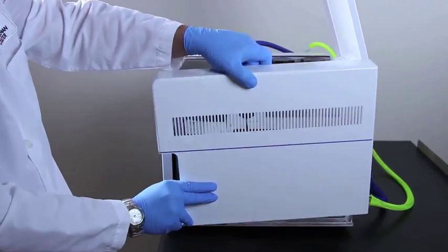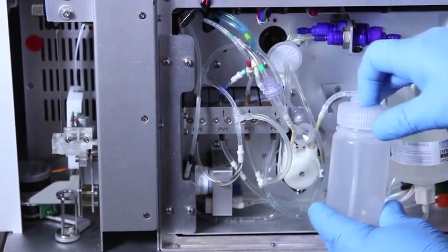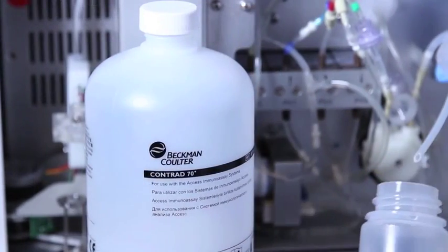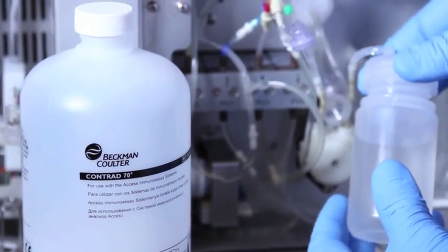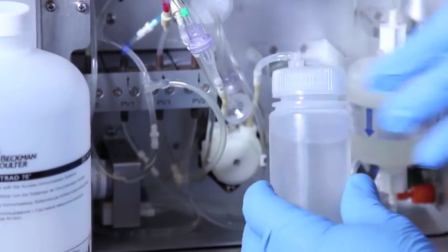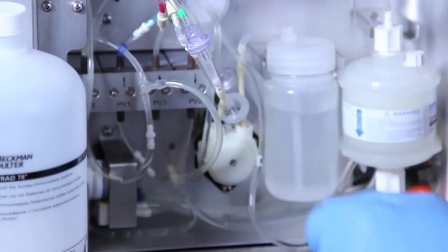Remove the deep clean bottle and fill with a one-to-one mixture of Beckman-Coulter Contrad 70 and deionized water. Please refer to the IFU for more detailed instructions. Replace the newly filled bottle. This completes the deep clean procedure.